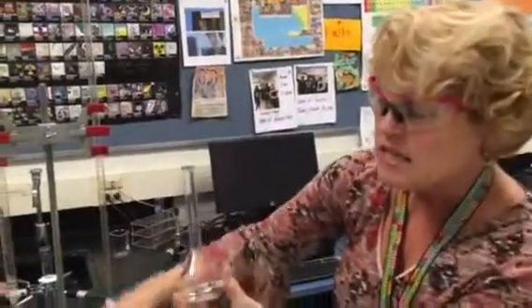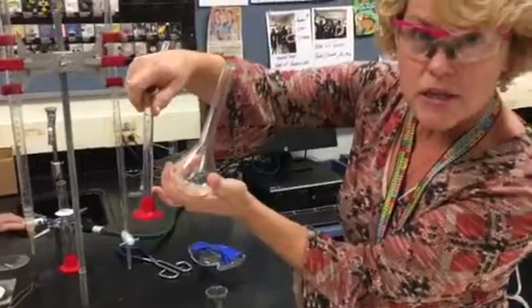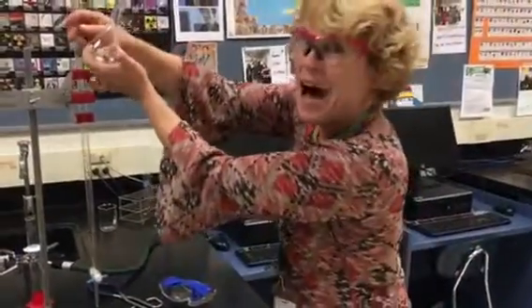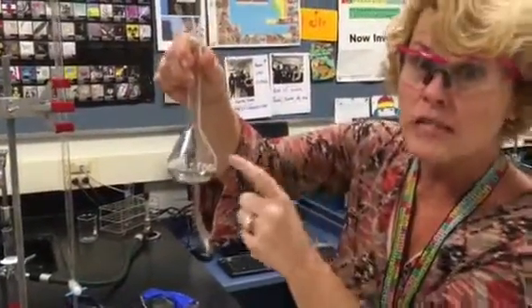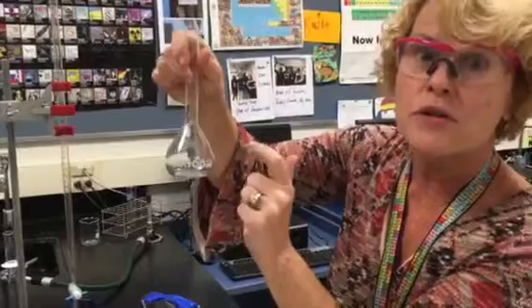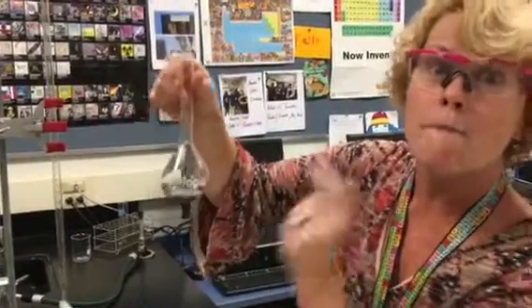So this is a 100 milliliter volumetric flask. Since this measures out to the hundredths of milliliters, tick marks go up by 0.1. This will also measure out to the hundredths. These are very good measuring tools. Okay, so that's 100.00 milliliters.